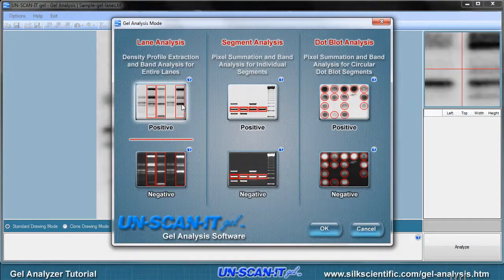There are several gel analysis modes available including Lane Analysis, Segment Analysis, and Dot Blot Analysis. These modes are explained further by clicking the question mark button associated with each mode.